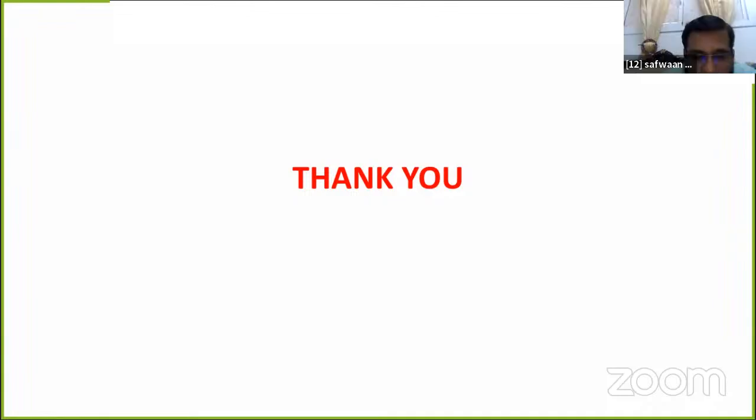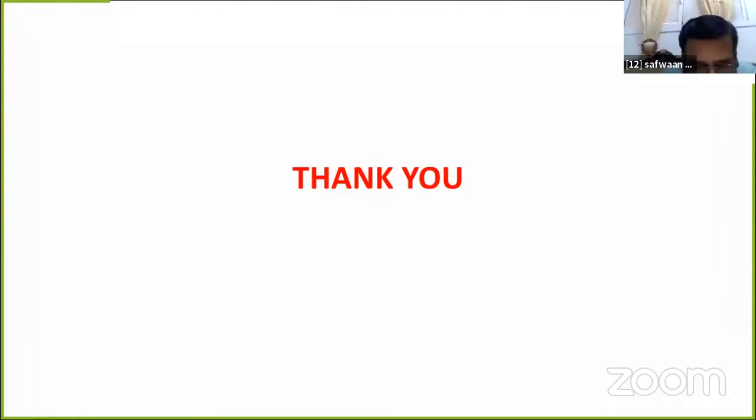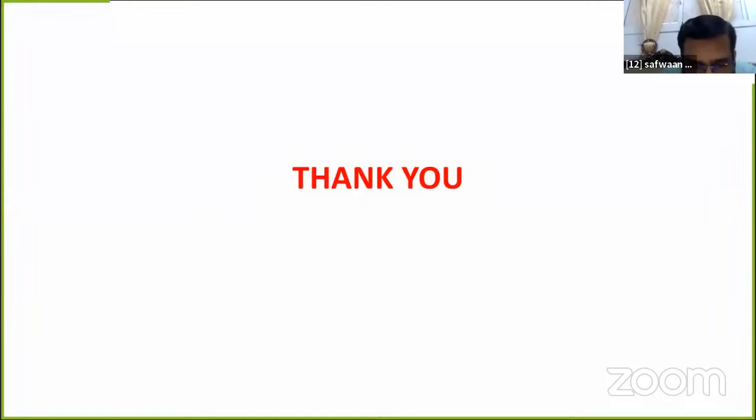Very good. It was an excellent lecture, as Dr. Deshmukh said. I really enjoyed the lecture. Now, I want to ask you a small query. For microaerophilic microbes, in your case, you mentioned Campylobacter jejuni. So how do you culture them from the water or food?